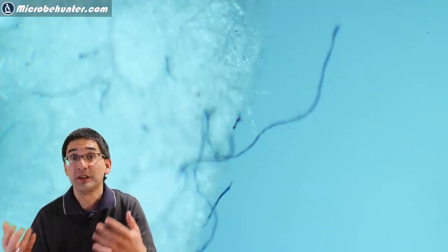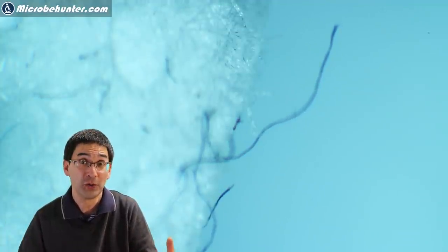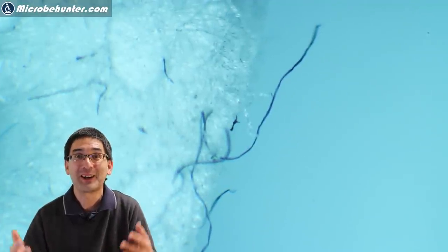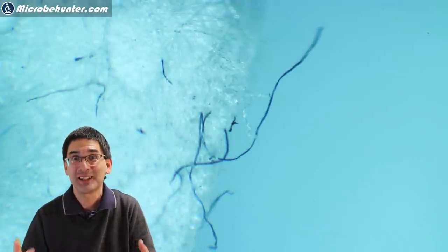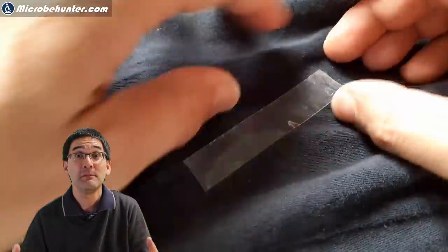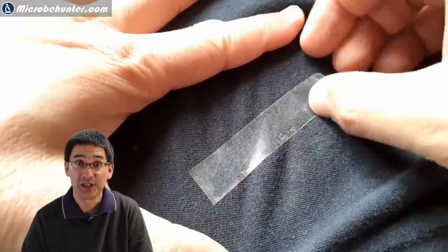I'm going to show you where you can isolate those fibers yourself so that you really believe me at the end that these are actually not worms but textile fibers that can be found in the environment. As a matter of fact they make up a large portion of our house dust.